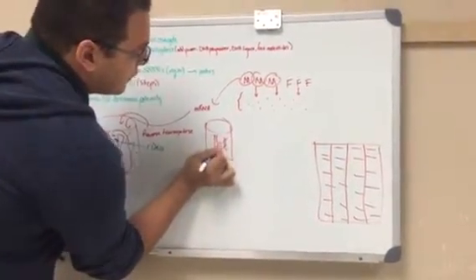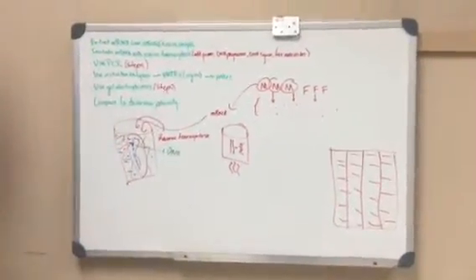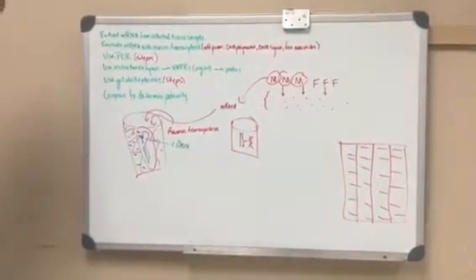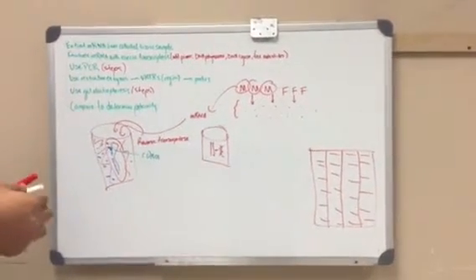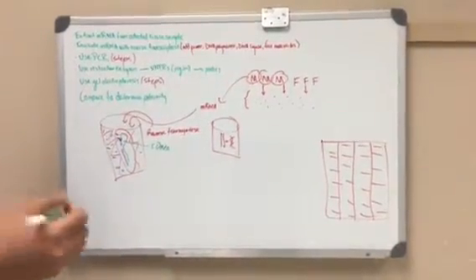And each DNA molecule will have its own primer. This is in a buffer solution, so all we have to do is add the primer. Once it's cooled, we're just going to remove this little fire. Once it's cool, we're going to go into the elongation or extension process, where we have to add Taq polymerase, which is just a special type of DNA polymerase. So we'll represent that with green.